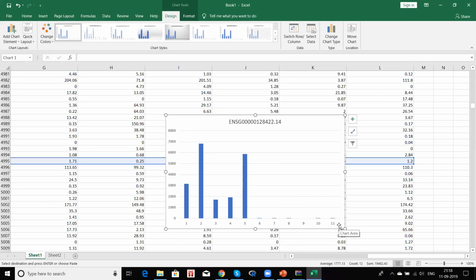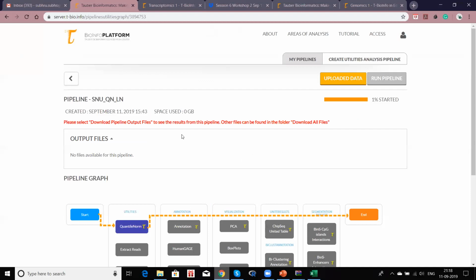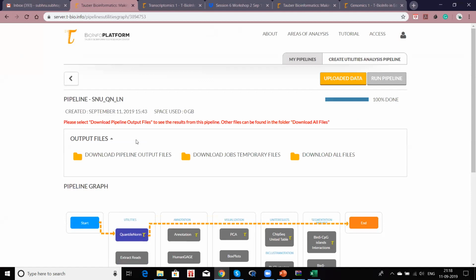But there's a problem once again. The problem is, you can see this one is slightly over 3000 and this one is 7000, whereas this one is just below 2000. So again, this is not so good for an analysis because we don't know how much of a difference should be considered to be a very good difference. So what can help us out from here? The thing which can help us out is this one, which we had set to cook. That's called log transform.